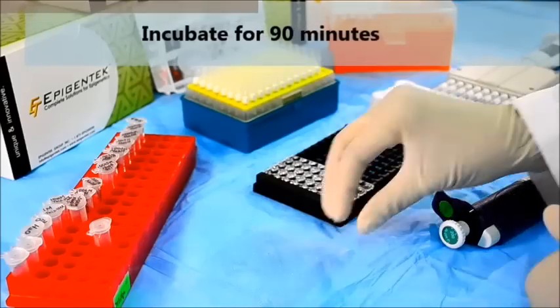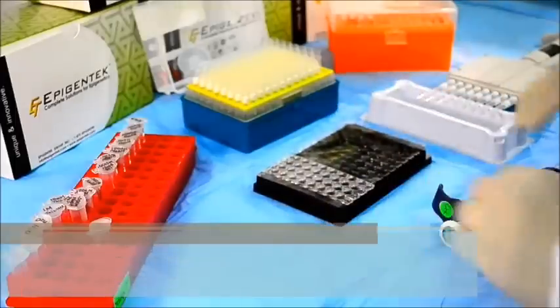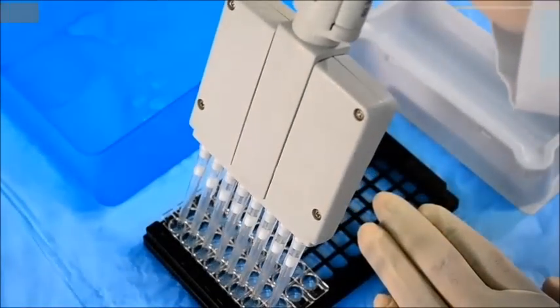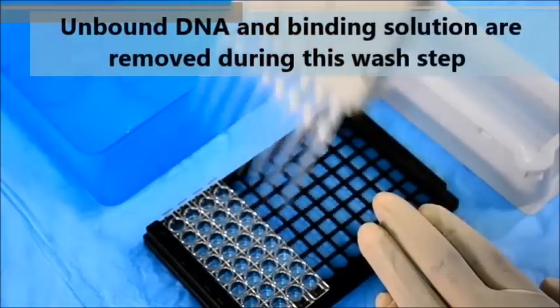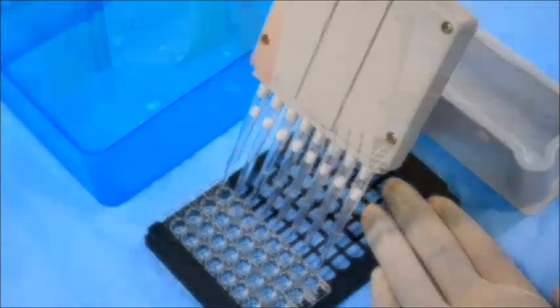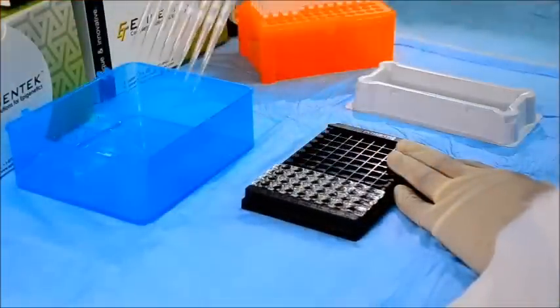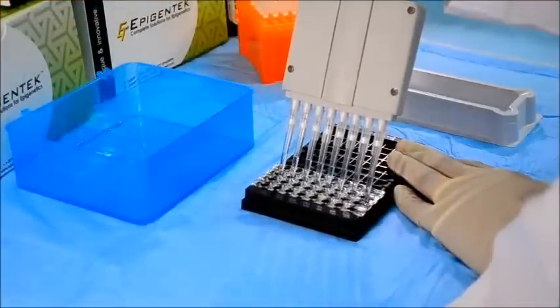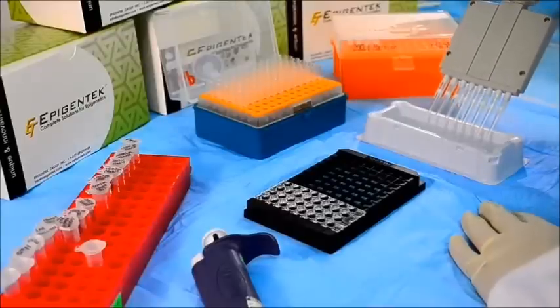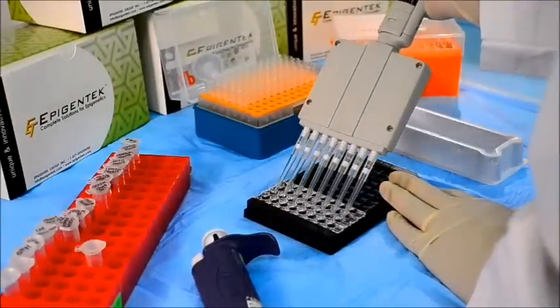Cover the plate and incubate at 37 degrees Celsius. After incubation, use a multi-channel pipette to remove the solution from the wells. Wash the wells by adding the wash buffer and then removing it with a pipette. Add the 5-methylcytosine capture antibody, which binds to methylated DNA with high specificity.